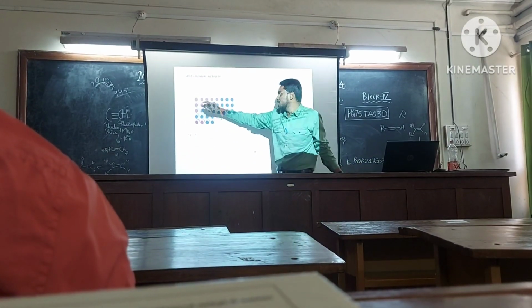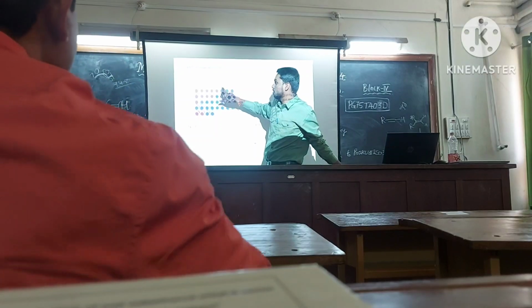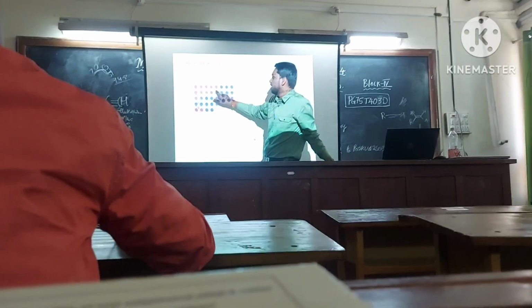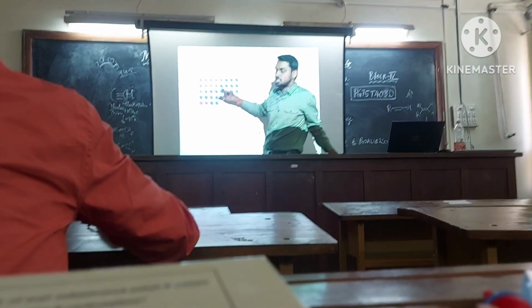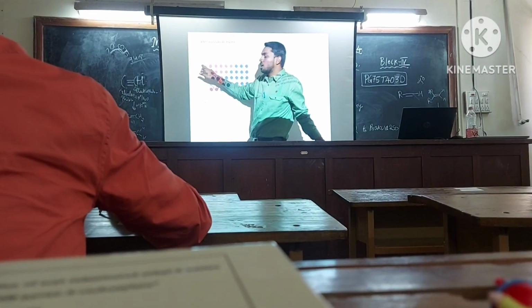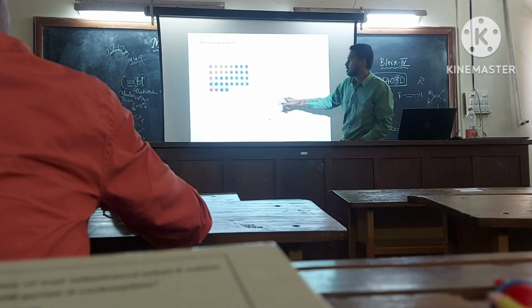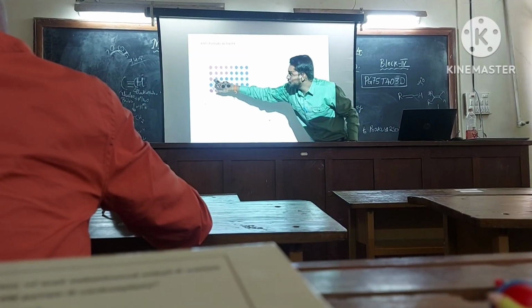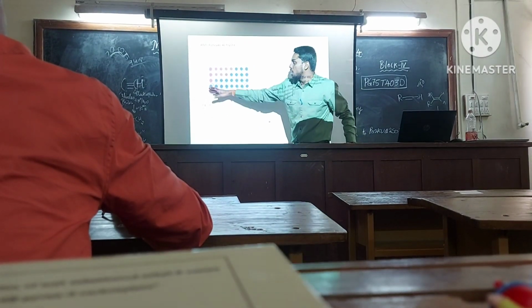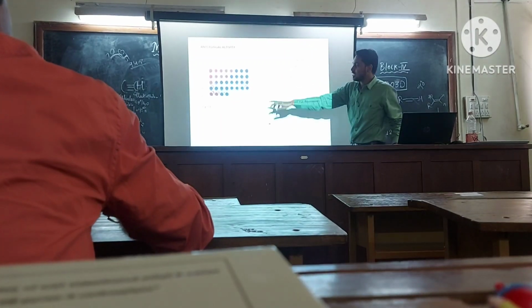So for C. albicans, it was showing the activity at 128 micrograms, but for C. glabrata, the PP was showing its antifungal activity at 64 itself. That means PP is more potent against Candida glabrata when compared to C. albicans. So those are the values I have put here. For fluconazole, if I give 8 micrograms, suddenly it is showing its activity, and itraconazole initially, like 4 itself, it is showing its activity. These are the controls.